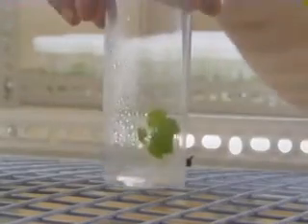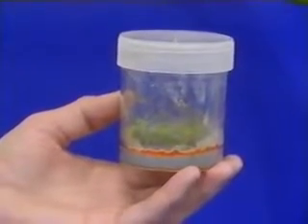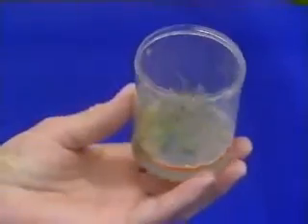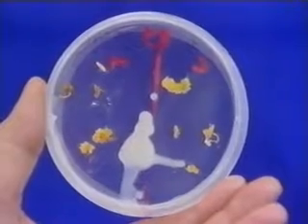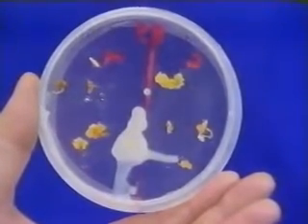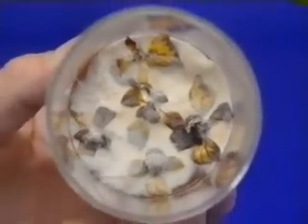Using antioxidants such as ascorbic acid or citric acid in the preliminary wash also may be useful. Use of liquid medium in the initial stage and frequent changes for several days may help leach out the phenolic compounds. The contaminants consisting of yeast and various species of fungi and bacteria usually appear on the medium surface within a few days or a week as white or opaque slime or as variously colored colonies. Sometimes black spores and mycelium can be observed.